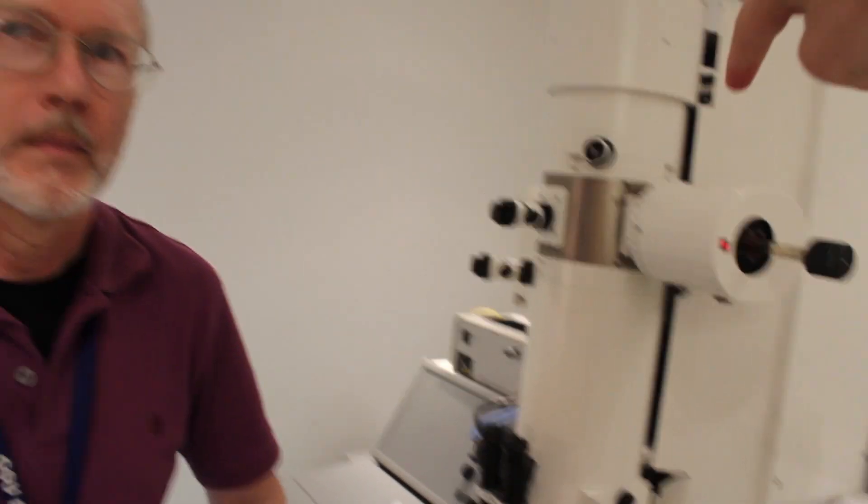I just figured out what I'm going to do with this video. So I bought an Olympus BH2 microscope and you did too, right? But you're like a professional microscopist? So you're going to... I'm going to explain the different types of microscopes at some point. So that was a scanning electron microscope in there. This is a transmission electron microscope? Yeah. So it doesn't scan.